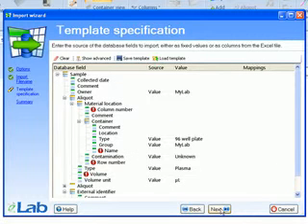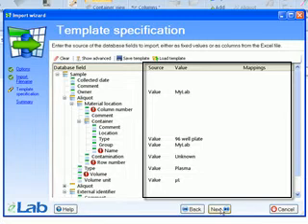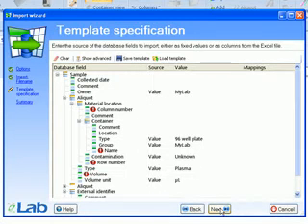This screen is where the Excel column to database field mappings occur. You are presented with the database field names on the left and the mapping settings to the right. To set a mapping, first select its type, either value or column. Choose value if you want to specify it once for all data, or column if you want to map it to a column in the Excel file.